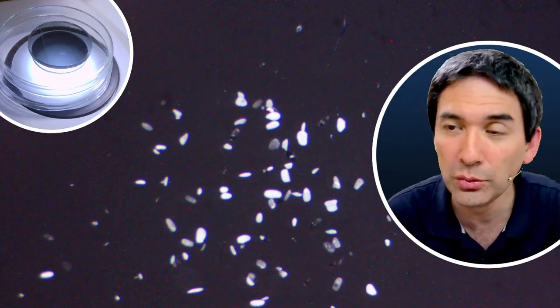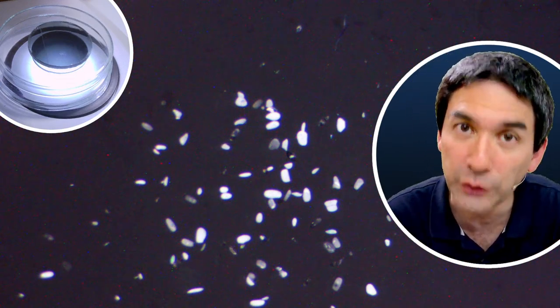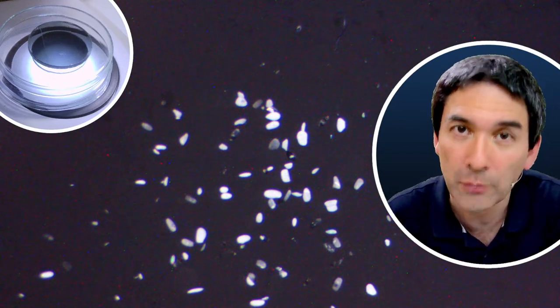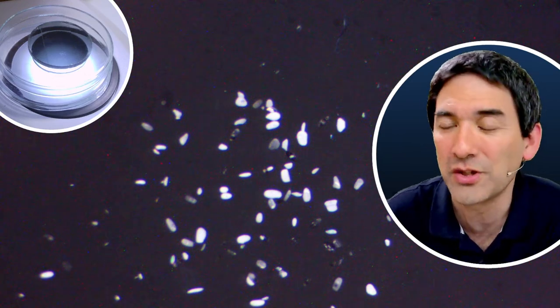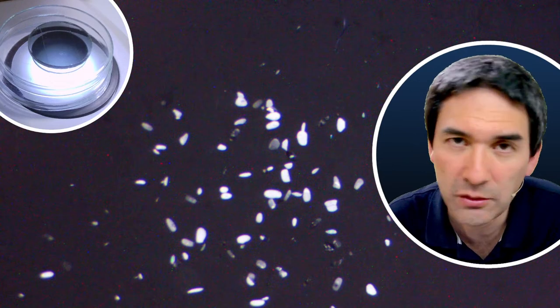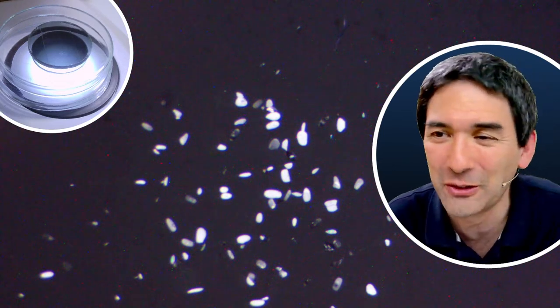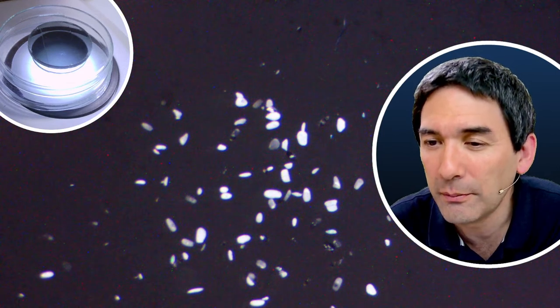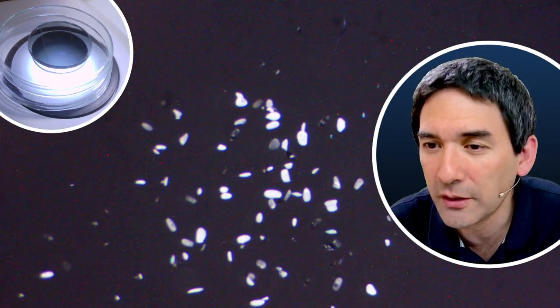So you do not really put the frozen water, the ice crystal itself, but rather the impression. So you kind of make a permanent slide of snowflakes, in other words. It's possible, and it works. Again, you need patience because not all snowflakes look equally nice. I made a video of this. Yeah, snowflakes actually are quite possible.